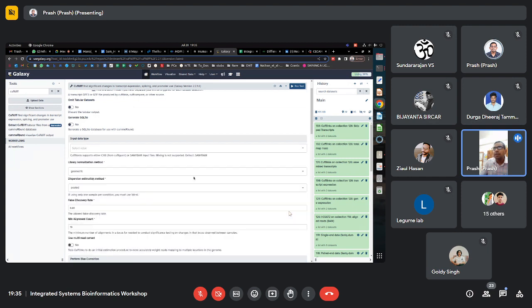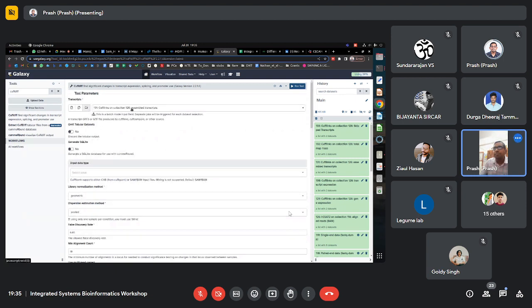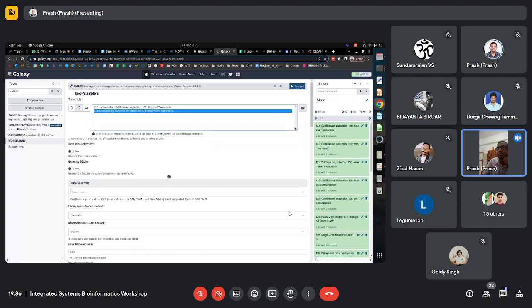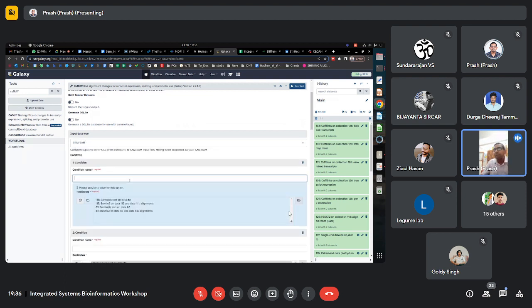Sorry, where is it? Yeah, Cufflinks this. You want to take that assembled transcripts. One minute. Assembled transcripts. And our input data is SAM or BAM, isn't it? Then you type the condition name. You always give control first, against the treated. So give control. And then you click this.